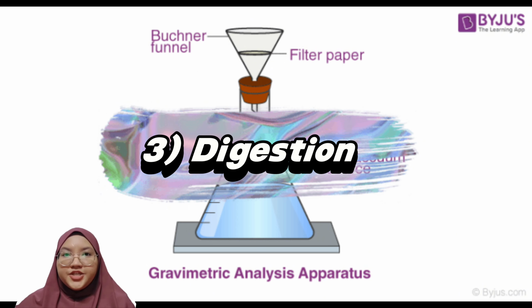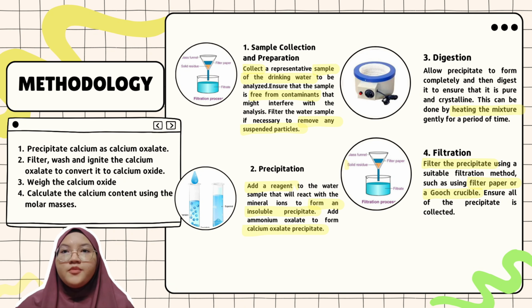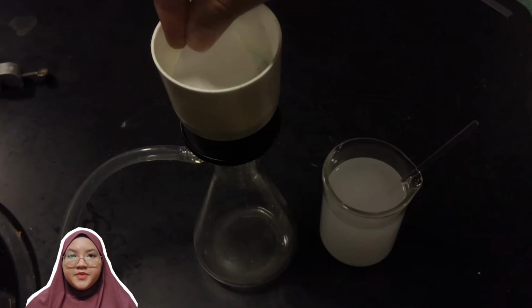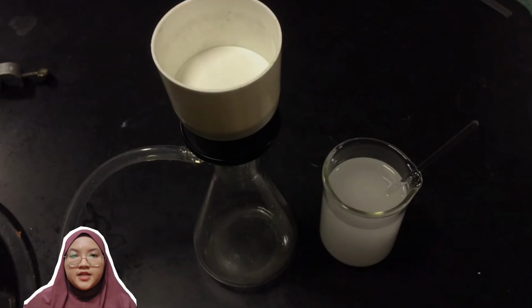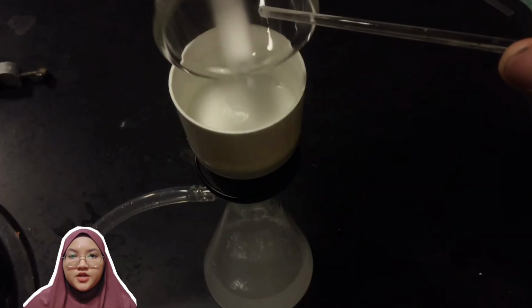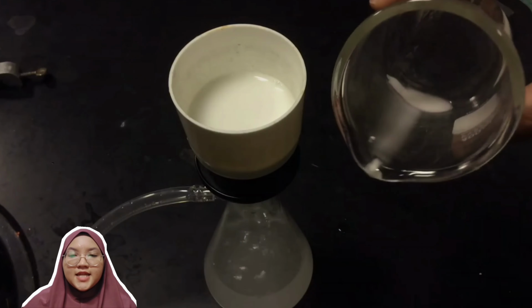Third, digestion. Allow the precipitate to form completely and then digest it to ensure that it is pure and crystalline. This can be done by heating the mixture gently for a period of time. Fourth, filtration. Filter the precipitate using a suitable filtration method, such as using filter paper or a Gooch crucible. Ensure all the precipitate is collected.